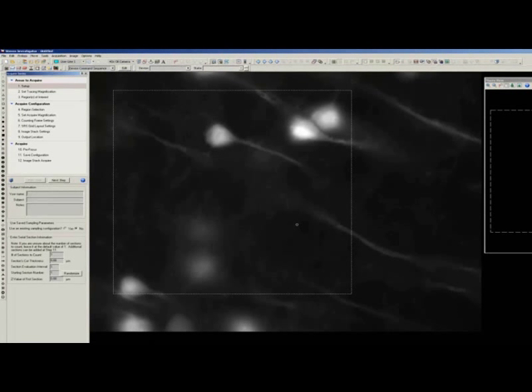For users who are familiar with our software, this process will seem very familiar. For those of you who are not familiar with this process, the workflow takes you through the entire process of performing SRS image stack acquisitions. And you can view more about this on one of our webinars that we've posted on our website, and we'll indicate where that is. So in step one, we are indicating some parameters such as the number of sections we will count and the section cut thickness.